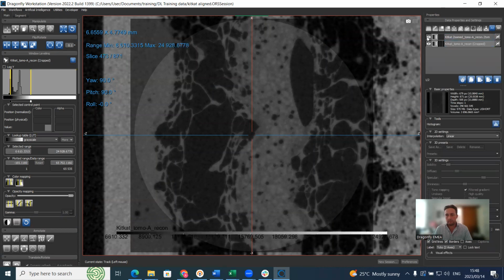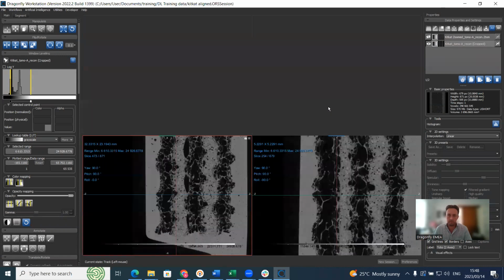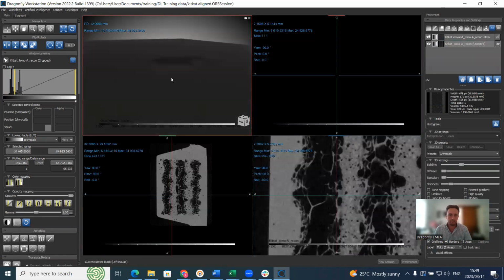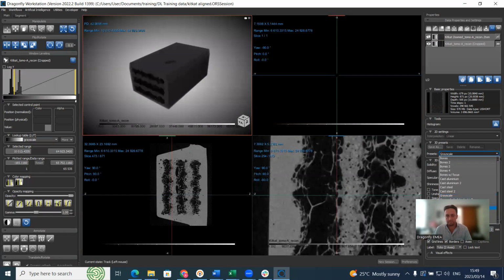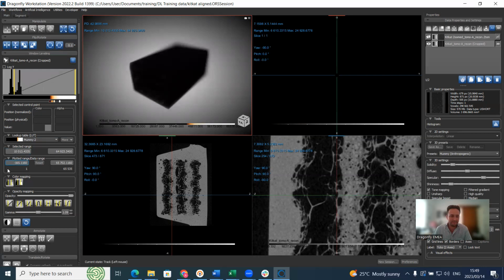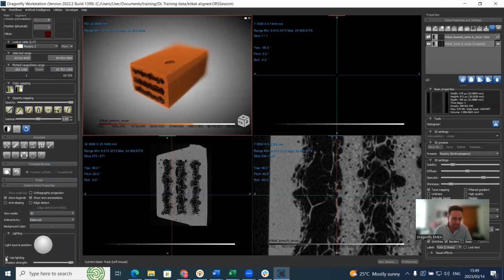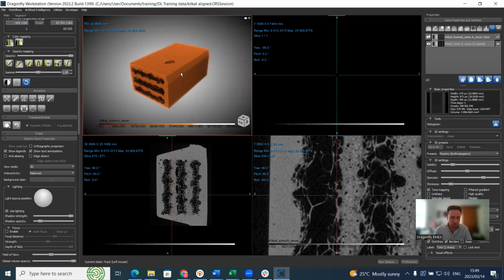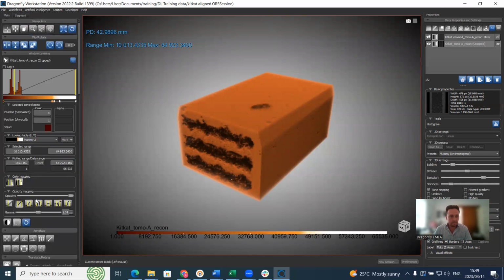Basically, we have the poor resolution scan or the full scan, which is a chocolate bar, which is looking like this. And we just need to contrast it in the correct way. So there's the chocolate bar. We can change its color a little bit. I don't know if that's necessarily better. And that preset has a focus enabled, which is not good. Okay, so that's not too bad. Sort of looking like chocolate. I guess you could improve it a little bit, but that's not the point of this video here.